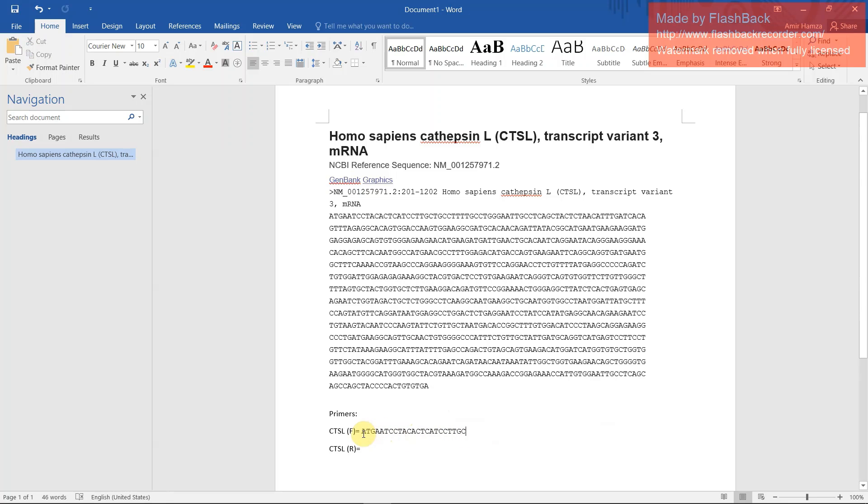You select your first forward primer and then reverse.